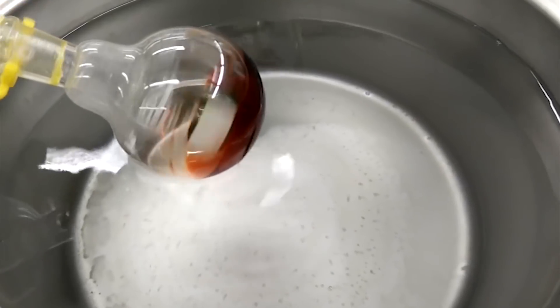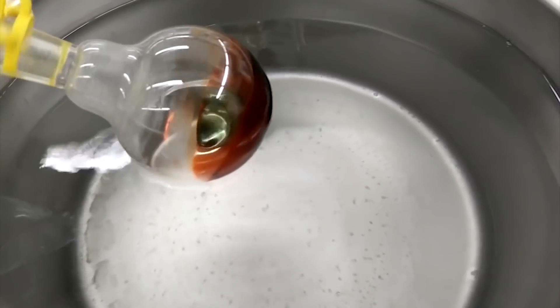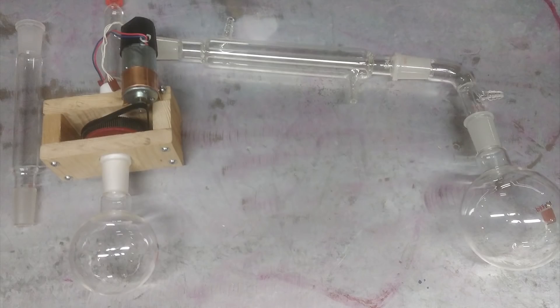But fluorescein is notoriously difficult to dry but also too delicate to heat up very much, so we used a rotovap to remove the solvent. These days I want one for similar reasons — I don't plan on using it that often but I thought it'd be a fun machining project and useful to have.